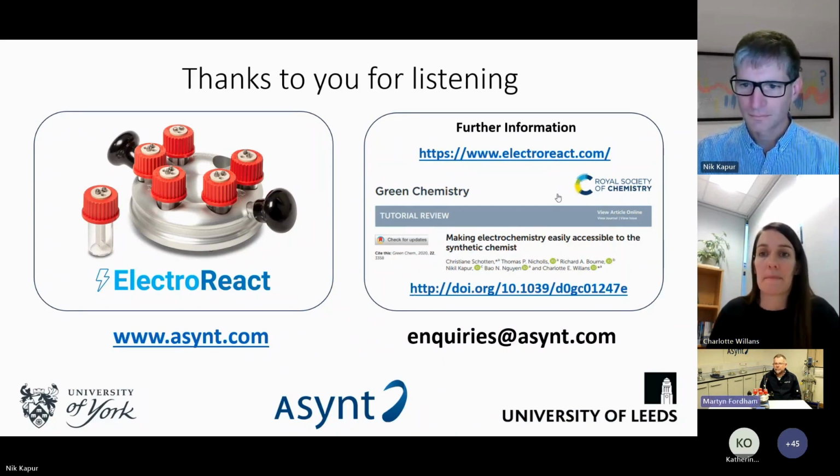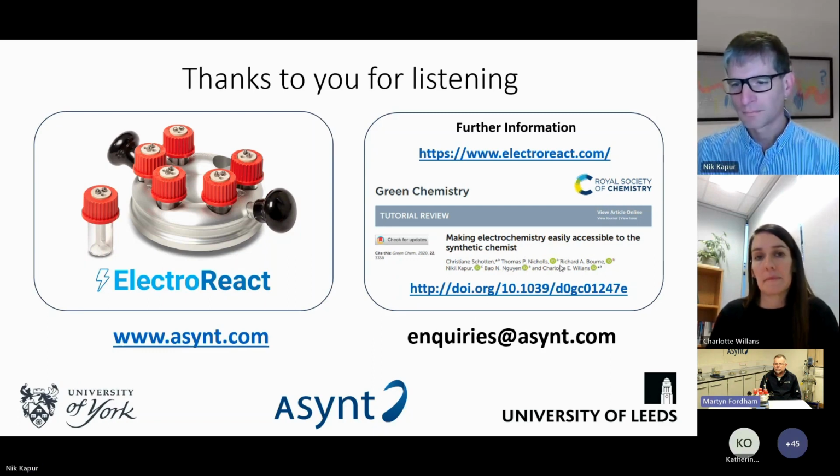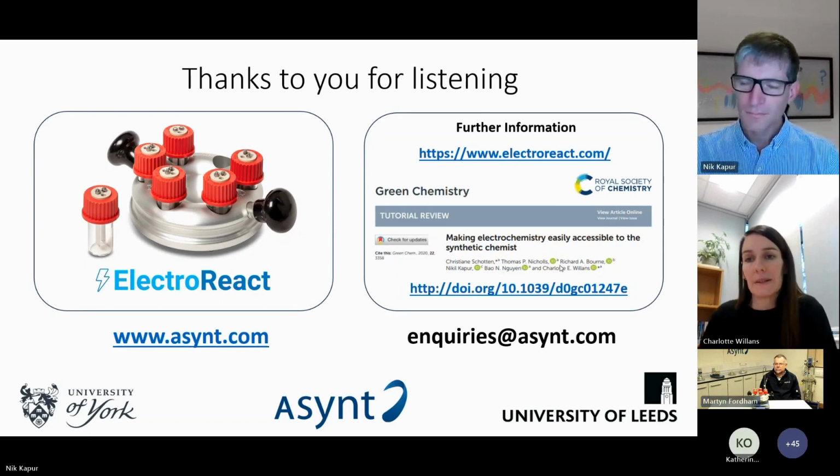Very good. So we've actually got a follow-up on that. Are there currently options for softer foam materials available? They can imagine that the locking mechanism might squish those materials.